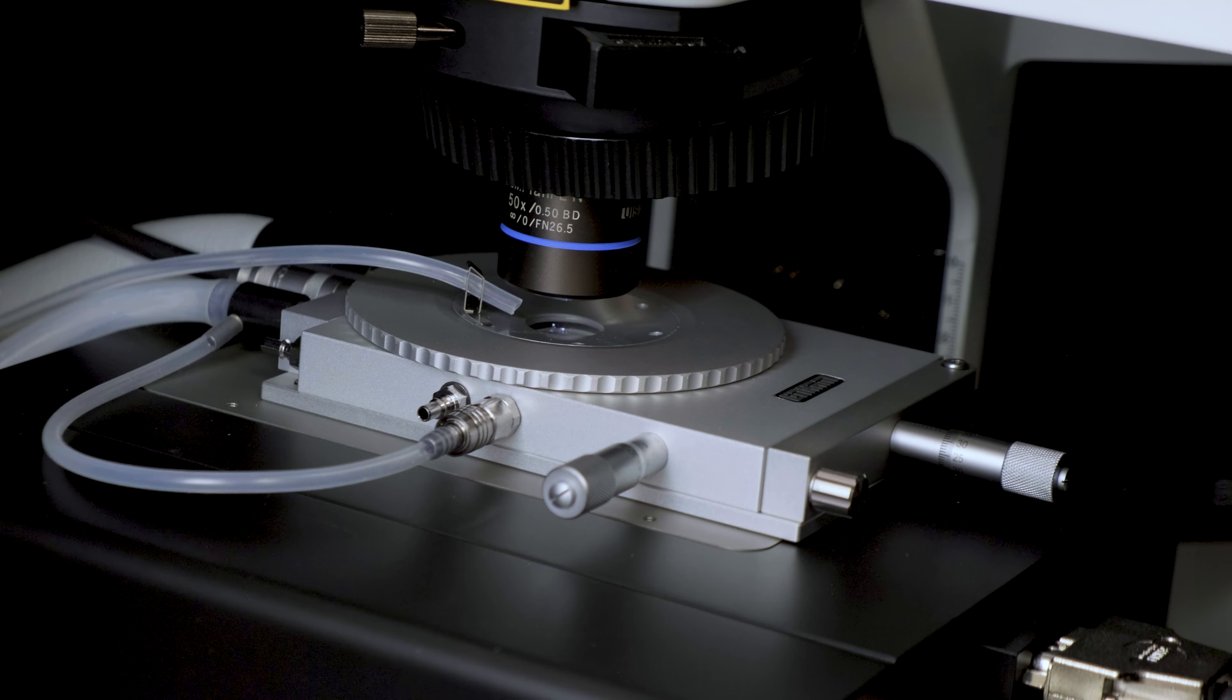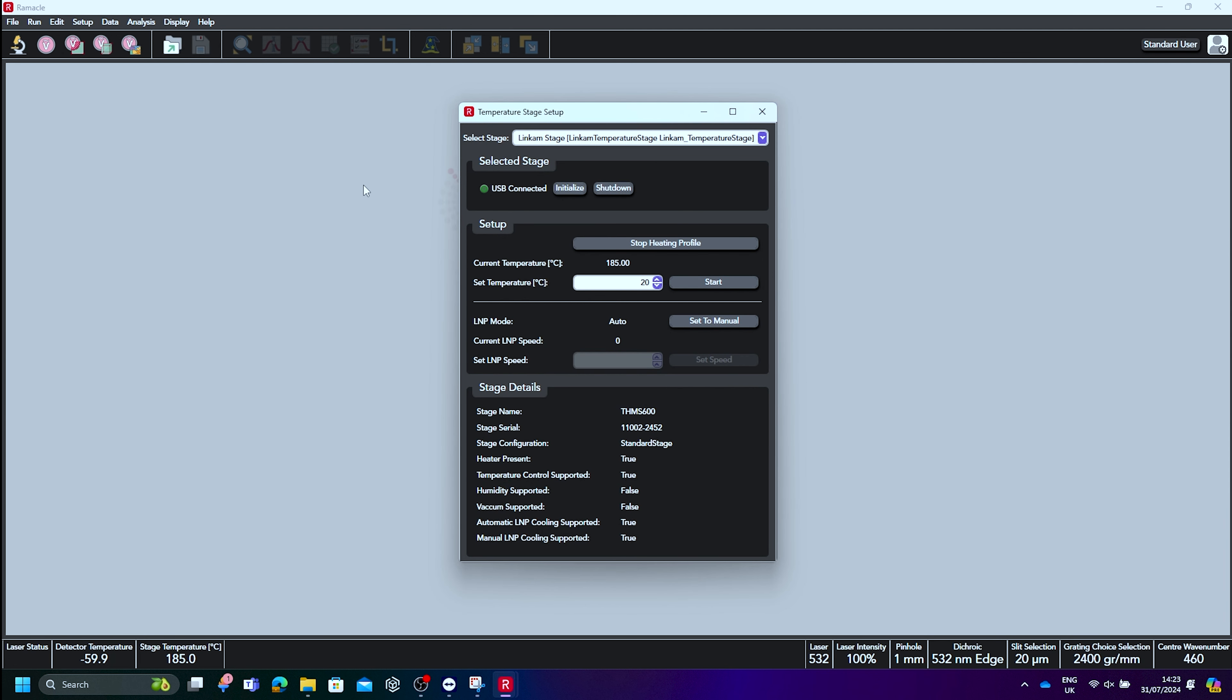With the sample in focus, we can begin setting up a variable temperature measurement. The sample can also be set to a fixed temperature and different types of studies can be performed, such as mapping. Here we will set a start temperature of 200 degrees Celsius.